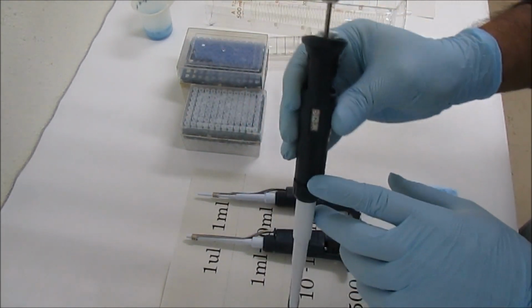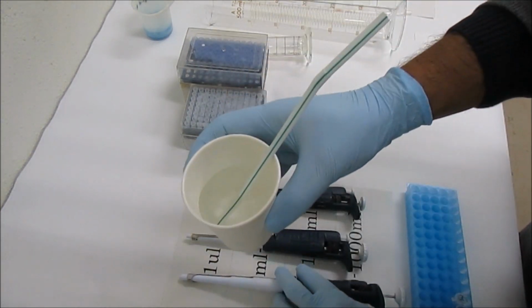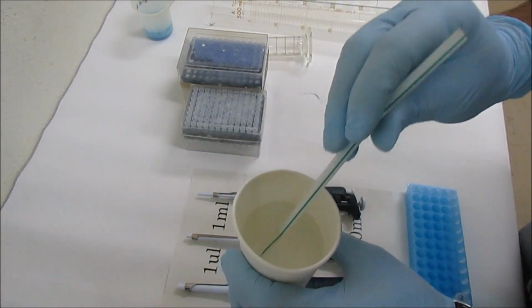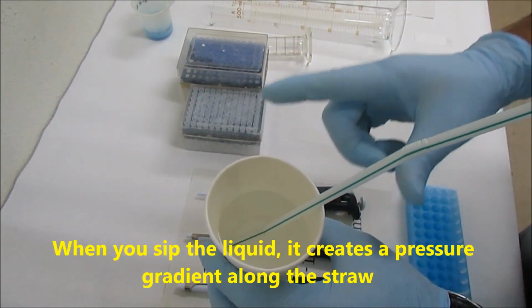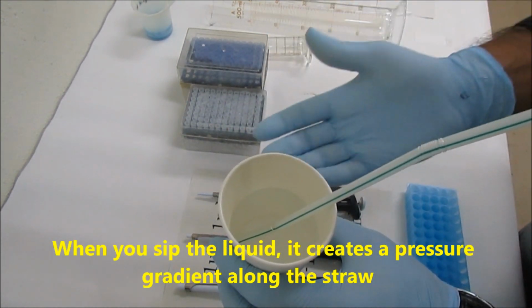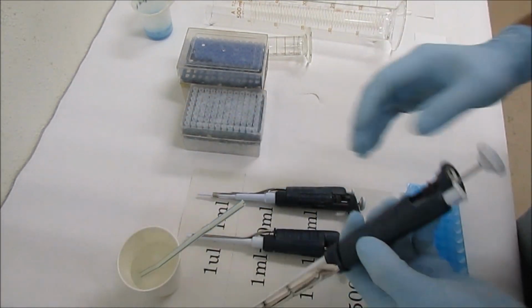First let's talk about the principle of the pipette. This is a very simple explanation. Think of how you drink a soft drink using a straw. You create a partial pressure, which in turn takes the liquid up. This is the same principle that the pipette works on.